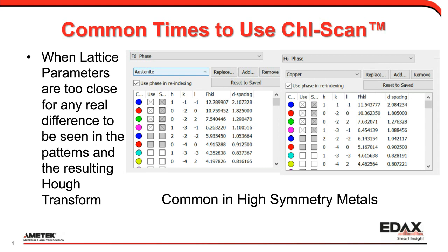So these essentially are, to any system, going to be the exact same pattern, and because of that, there's no differentiation. There's no differentiation in my map. So it's kind of just who's going to win, essentially a coin flip. And that's not going to give you any good data. It's going to give you very speckled data. You see that kind of thing in your data.